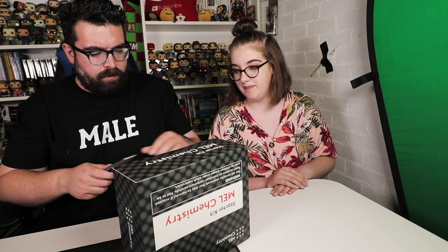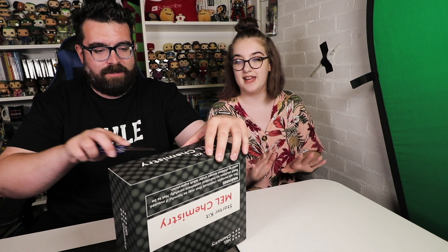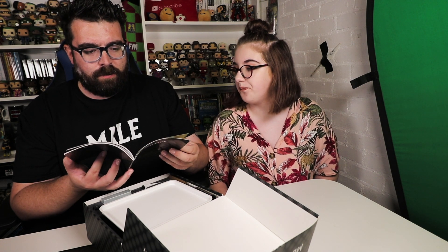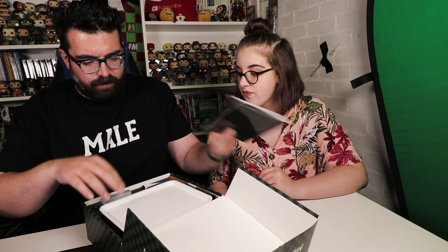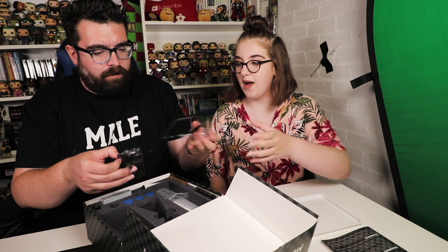So we've got some tape, and it even says on the bottom here what we've got. We've got beakers and safety glasses, and we've got a stove. That has to stay away from me. Safety and stuff. Right, here we go. We have reading material - safety instructions, which we're going to read before we get going. Safety instructions, first aid stuff, information for parents, information on what's included, and the before-you-start instructions. So we've got rubber gloves and goggles in here. We have a tray for doing science with. We have a couple of pairs of safety goggles - one for me, one for you.